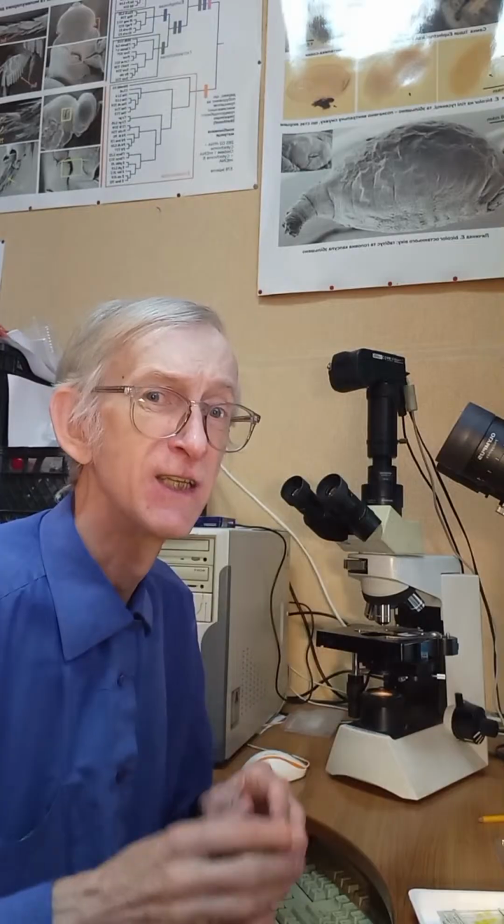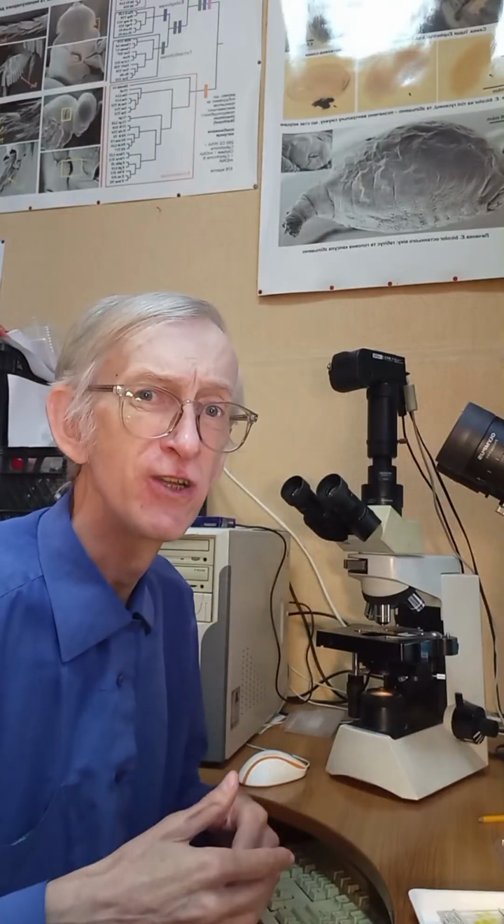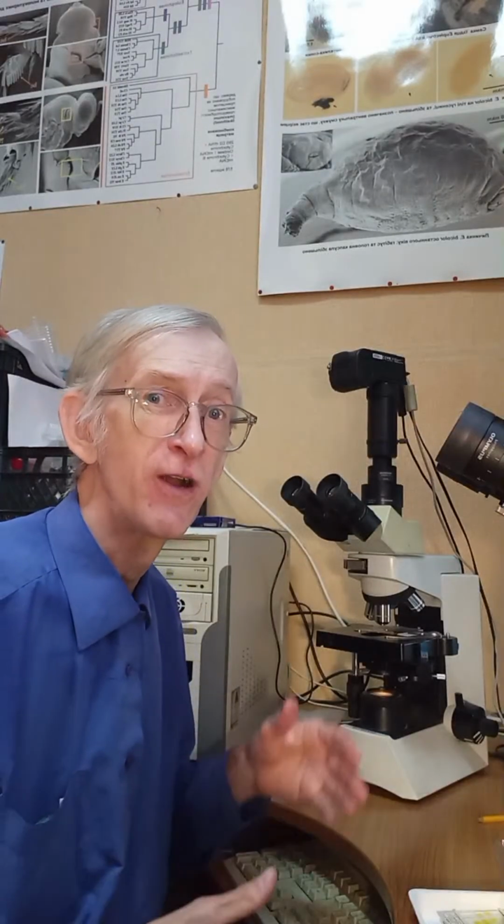If there is this mixture of different species in the laboratory, it means you need to eliminate this culture, because you may have a large number of Trichogramma evanescens and a small number of Trichogramma pintoi, but still, during a lot of multiplications, during several generations in a year, maybe 10 or 15 generations in the laboratory, Trichogramma pintoi will suppress the population of Trichogramma evanescens. So the efficiency of application of Trichogramma pintoi will be less in agriculture than the efficiency of Trichogramma evanescens.